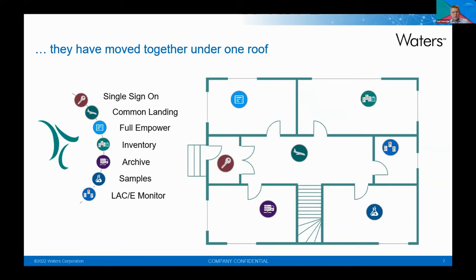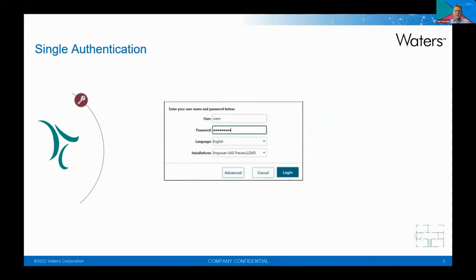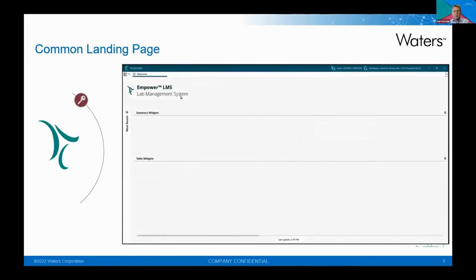And then a monitor, which allows you to observe your interfaces to the instruments, where we also have new offerings to share. So that's a lot of interesting stuff, which we will see. And I give you some screenshots, some initial food for thought on what this means. Because when you log in to the application, you have both of the selections, the selection on the details about your sample management, etc., and also about the Empower environment. So you can really choose what you want to see.